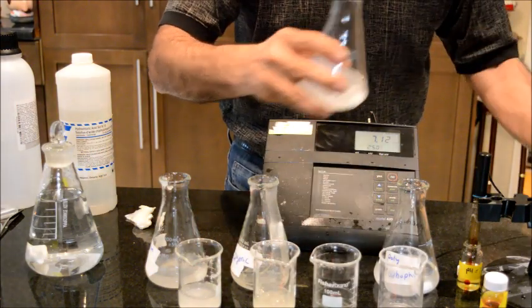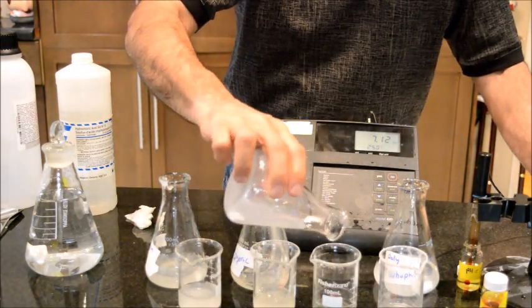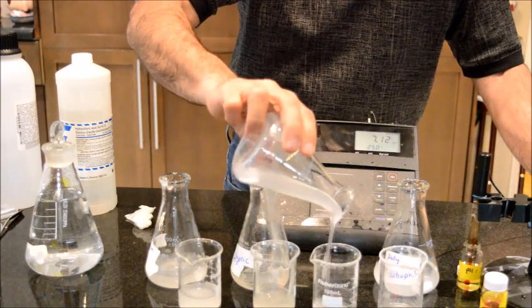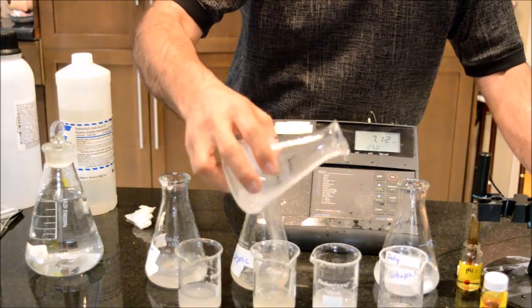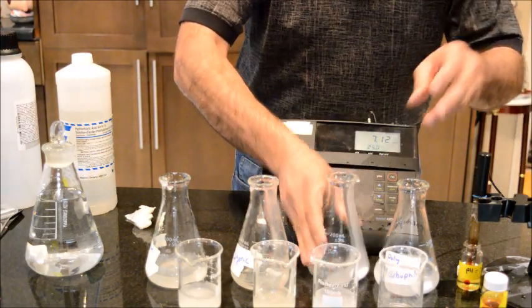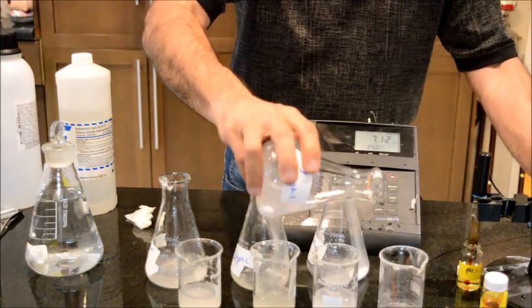Carbomer 974P, 2%. And the last is Polycarbophil, 2%.